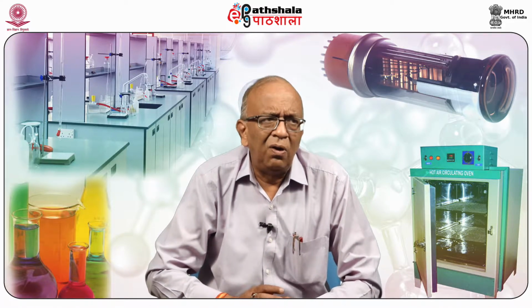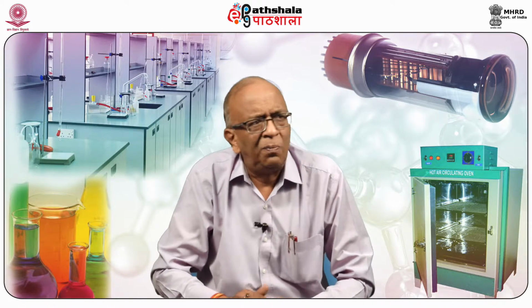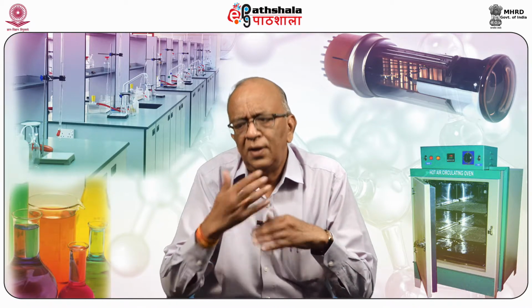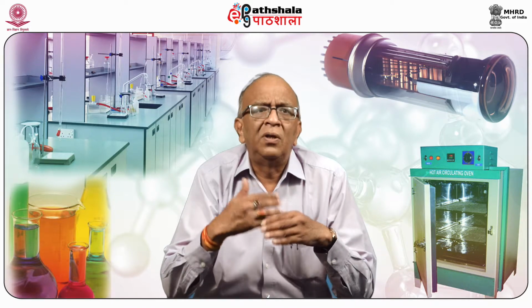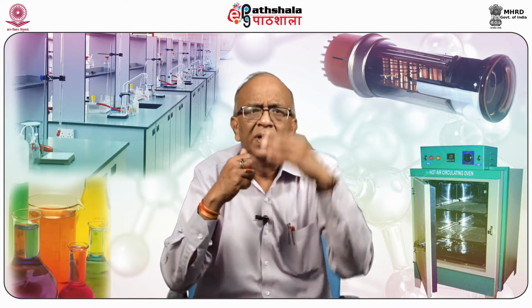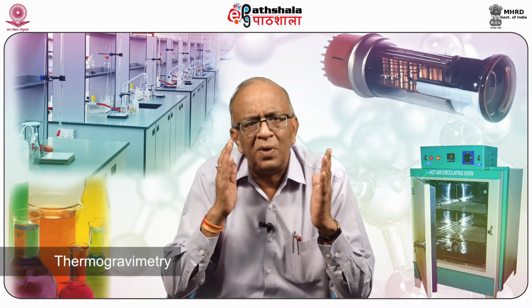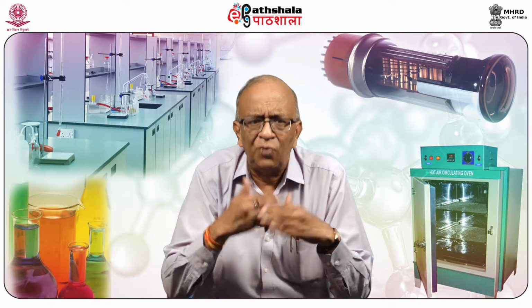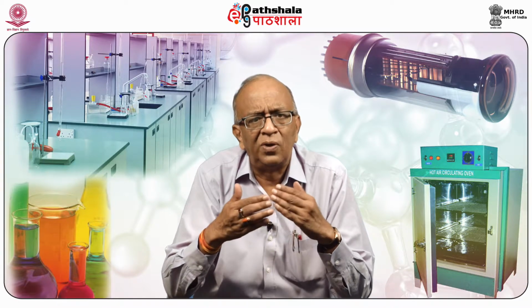In all these 10 or 15 thermal techniques, the basic thing is the same: we are applying heat. We are heating the substance and observing the changes caused due to the effect of heat, the thermal effect. The first type of technique here is thermogravimetry. As the name implies, it is gravimetry, taking the weight. So we take the weight on heating.